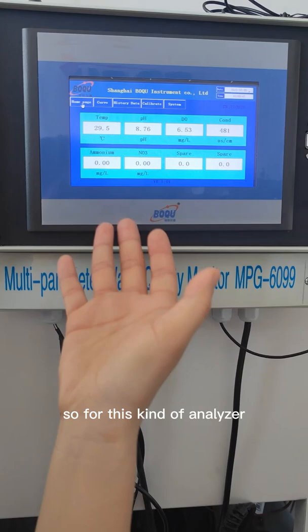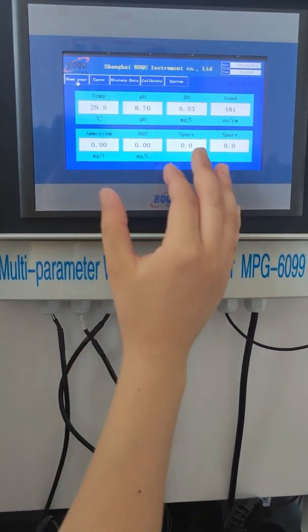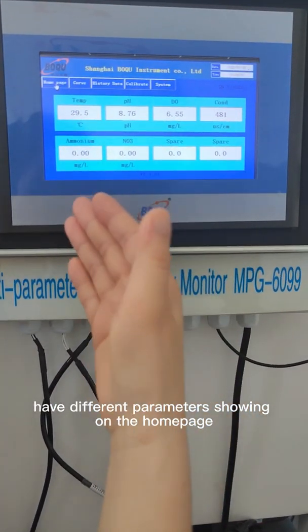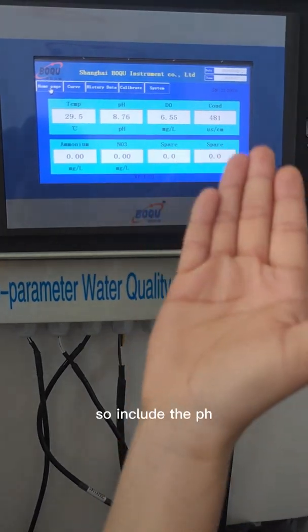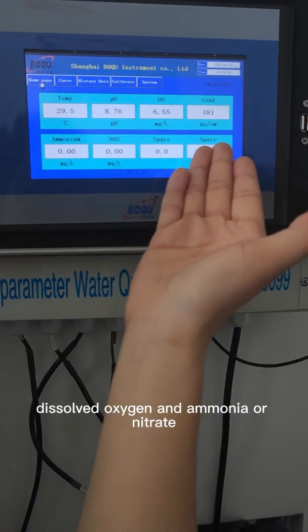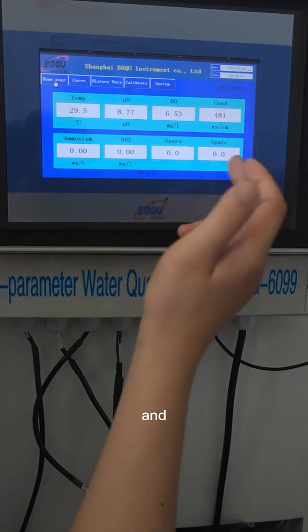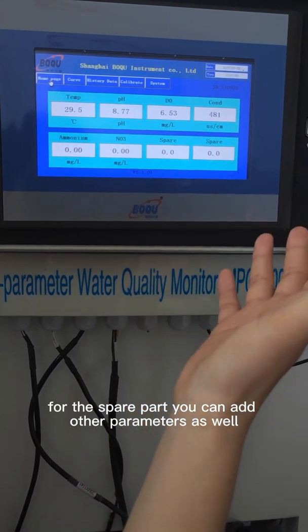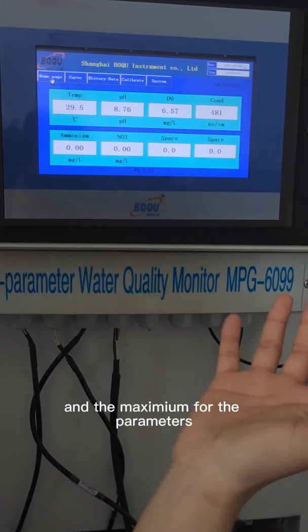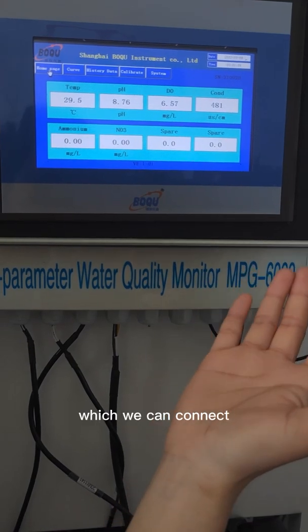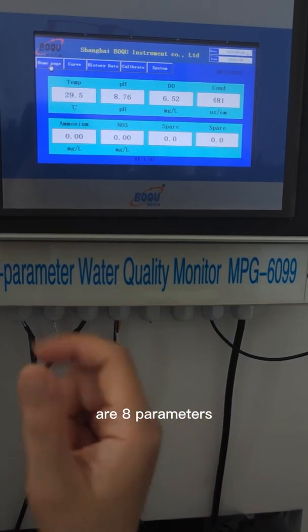For this kind of analyzer you can see we have different parameters showing on the home page. This includes pH, dissolved oxygen, ammonia, and nitrate, and for the spare part you can add other parameters as well. The maximum parameters we can connect is eight.